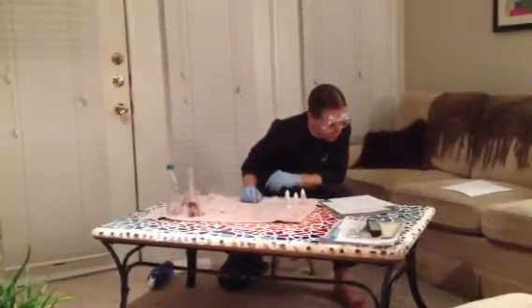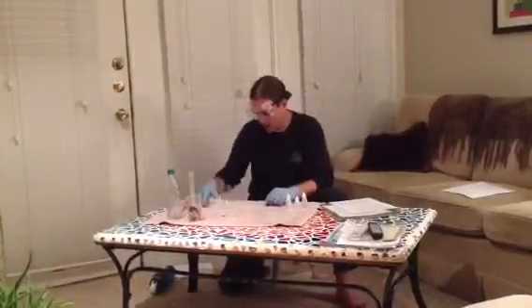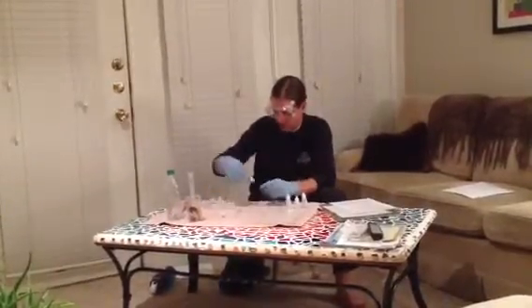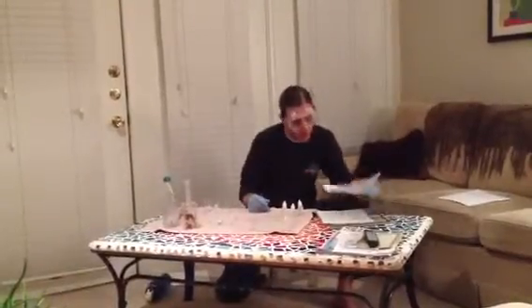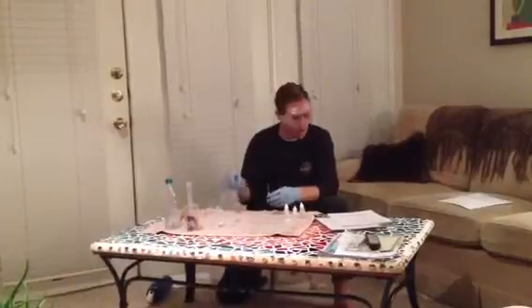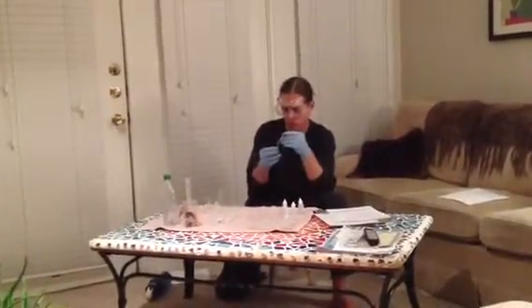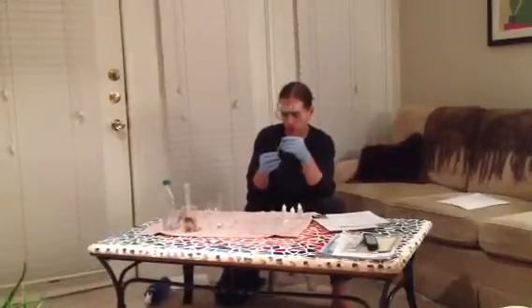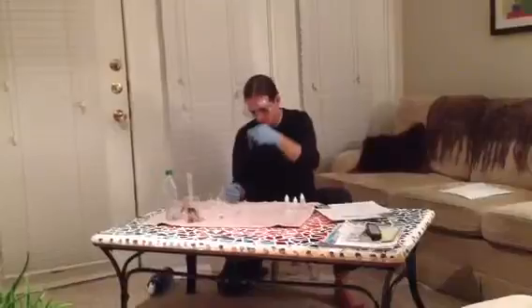So, to start with, I'm going to be putting 8 drops of the anions that are being tested. So I'm going to go ahead and start with bromide. I need to put 8 drops in here. So 1, 2, 3, 4, 5, 6, 7, 8. All right.